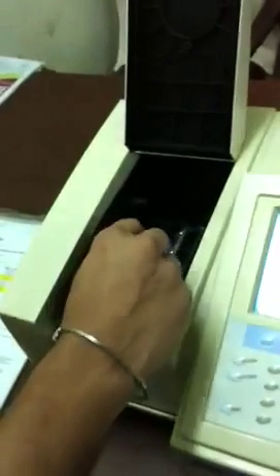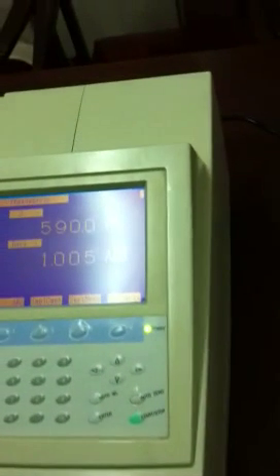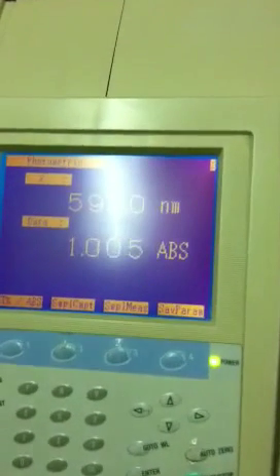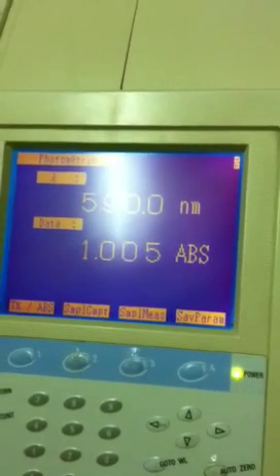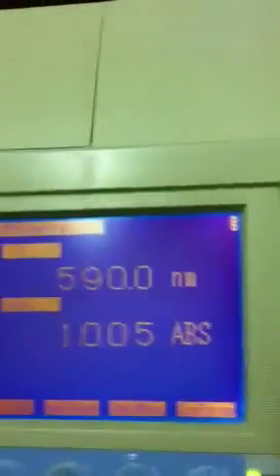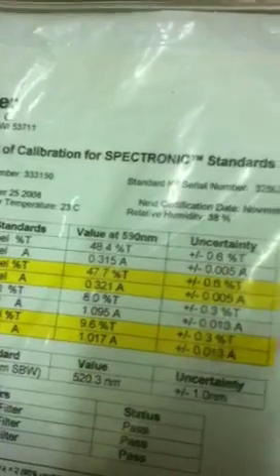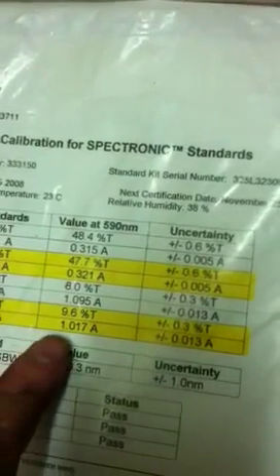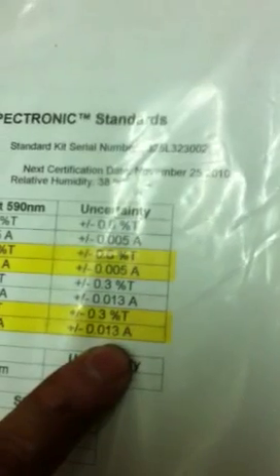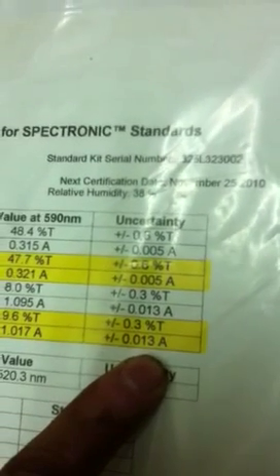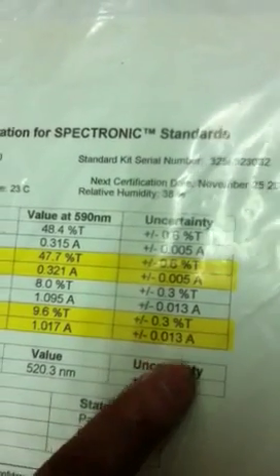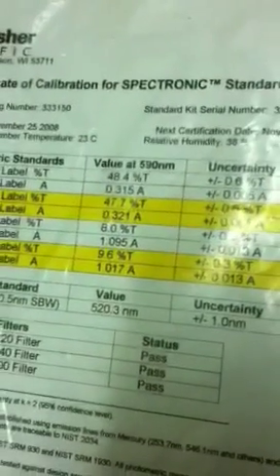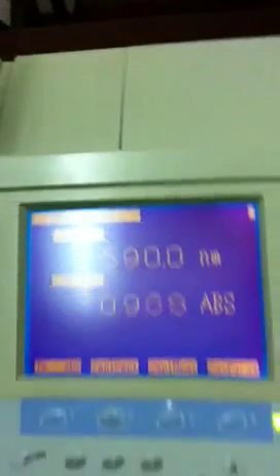There is another standard, 590, it's 10% yellow. Now the reading is 1.005. Now at 10% yellow it's 1.017 plus minus 0.013 so that's within range also as you can see.